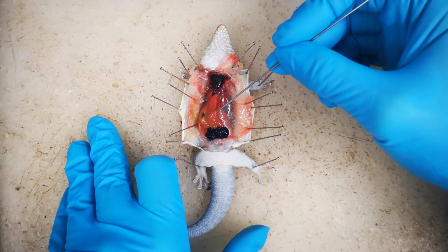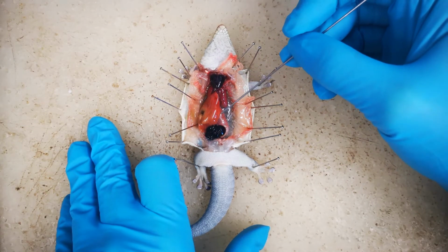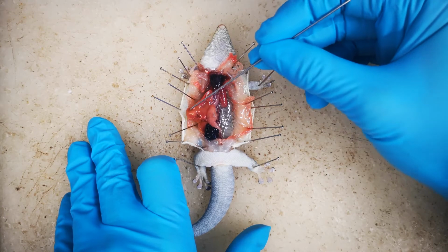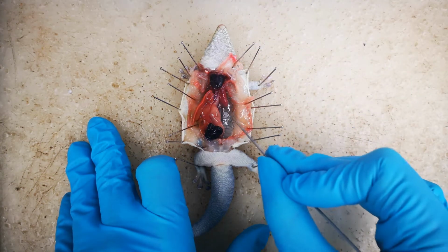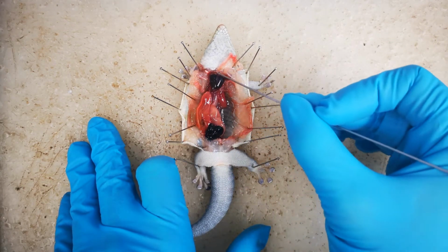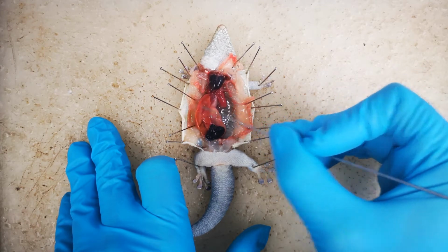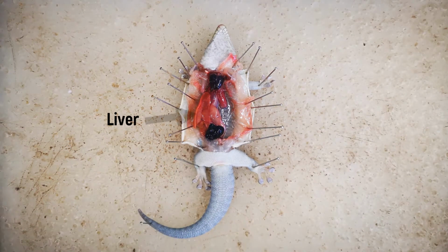We can now examine the organs of the gecko. A blunt probe is used to manipulate the organs without tearing anything. The large reddish-yellow structure is the liver.